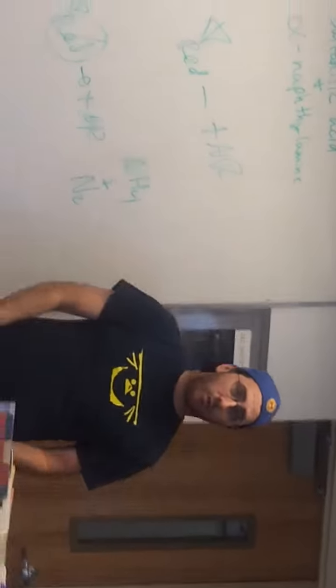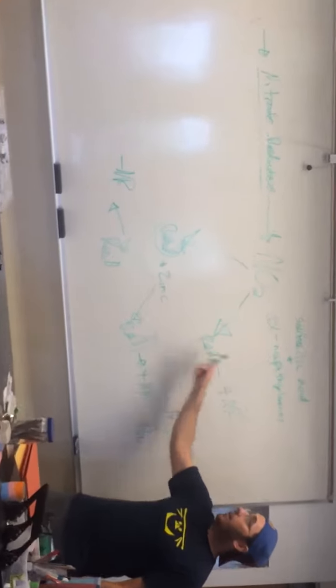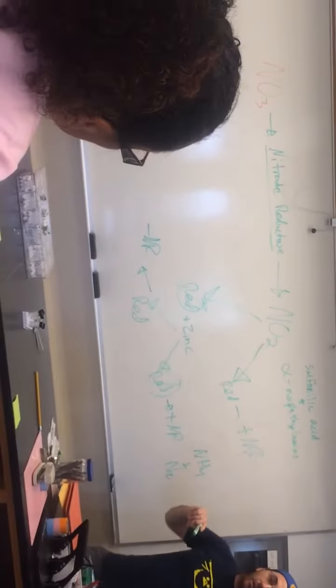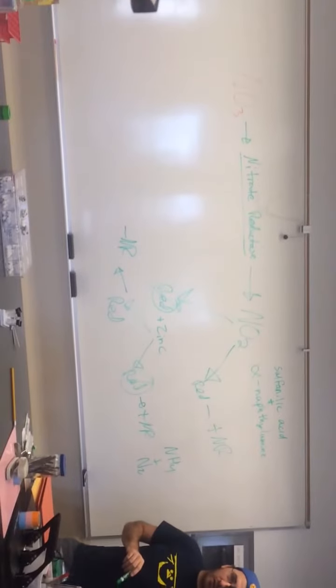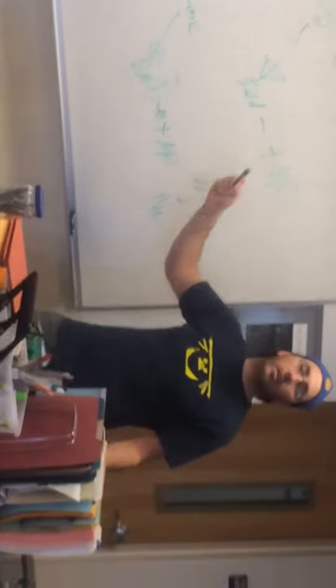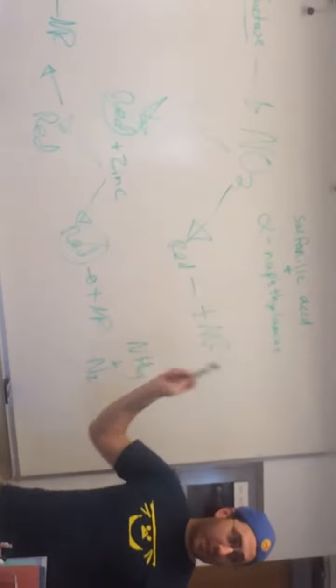That way, if you see multiple choice questions with a basic understanding, you add these reagents to get red. It means what? Positive A, positive B, negative C, all of the above, none of the above? Or I could ask, you add sulfanilic acid and alpha naphthylamine, what were you testing for? Nitrate, nitrite, ammonia, nitrogen gas? If you know the complete story, that's just as easy a question as telling me what red means. Understand all this. This is an essay question.